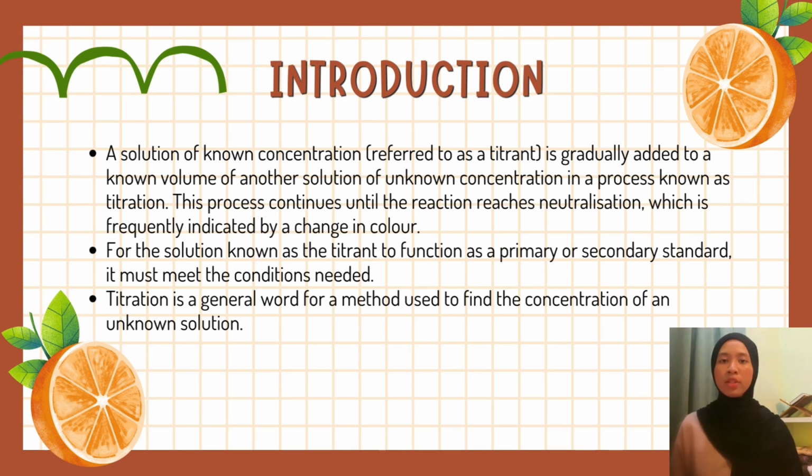Today we are going to present about volumetry analysis, the determination of vitamin C in orange juice. Firstly, let's go to the introduction of this presentation.